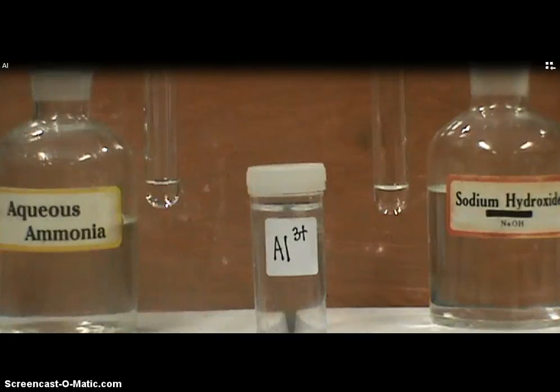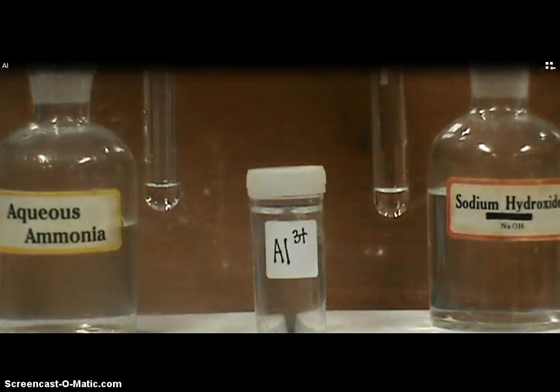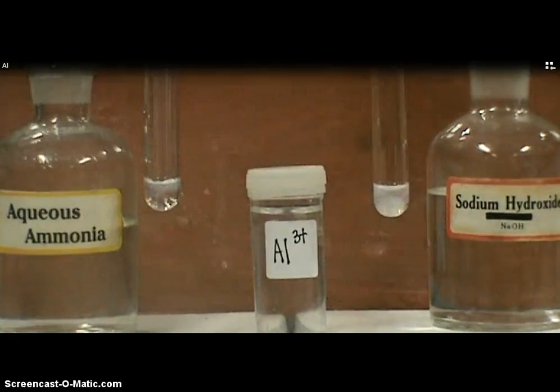Moving on, we'll look at the aluminum ion. When a few drops of aqueous ammonia and aqueous sodium hydroxide are added to solutions containing aluminum ion, we notice that a white precipitate is formed in both test tubes. The precipitate is gelatinous in texture.